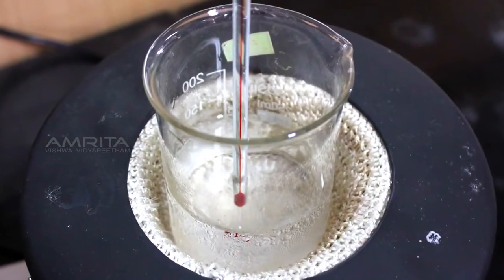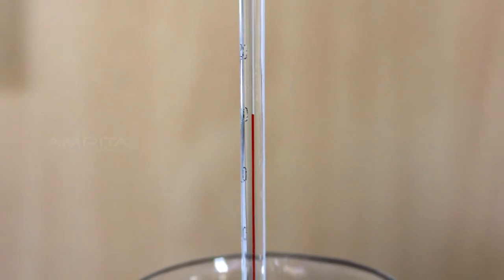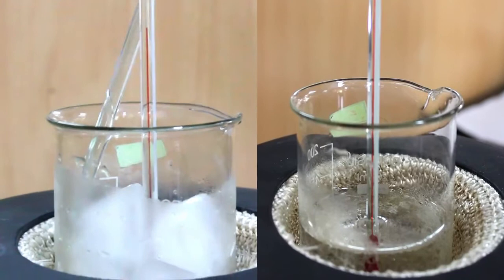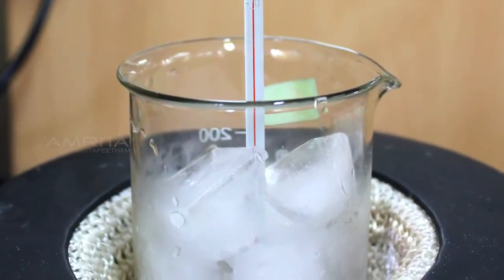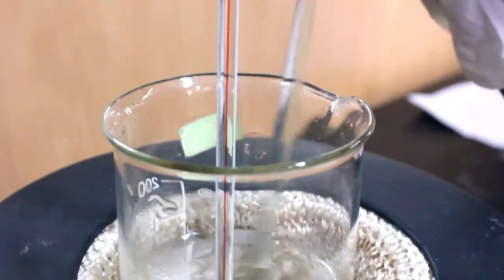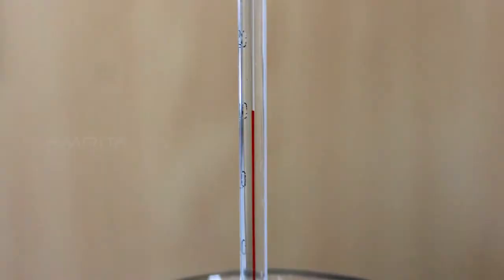We can observe that the temperature remains at 0 degrees Celsius. Now, take the mean of these two temperatures, T1 and T2, to find the melting point of ice. Since both the temperatures are at 0 degrees Celsius, we get the melting point of ice as 0 degrees Celsius.